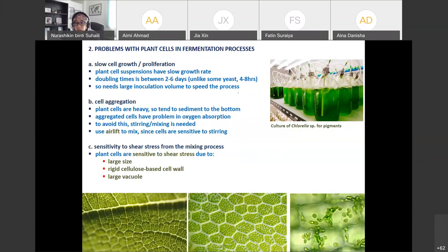So aeration, this is a lab-scale bioreactor, but it's in the lab. But if let's say with a bioreactor, there are ones that are manufactured by a supplier, so that one is the solid structure. But this one is if you want to make lab scale for your culture for the plant cells, you can insert tubing inside, and that's how the aeration is provided, and also the mixing. Because of the aeration, there will be motion inside, so that's how the things can be mixed inside.